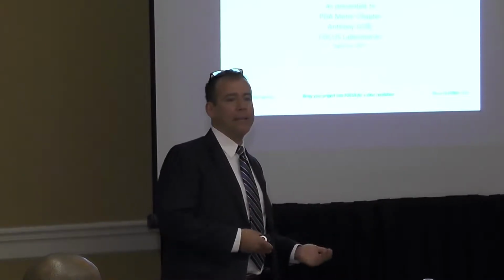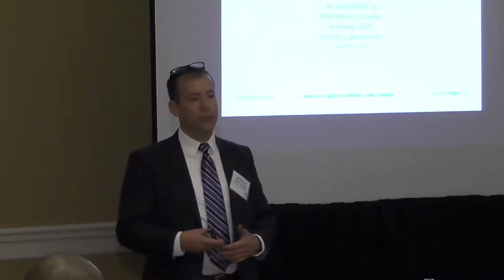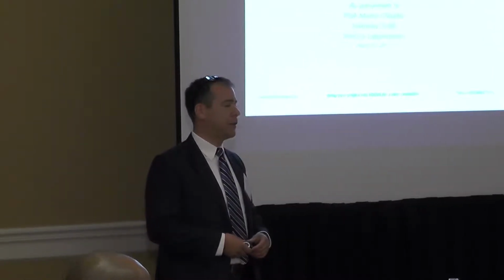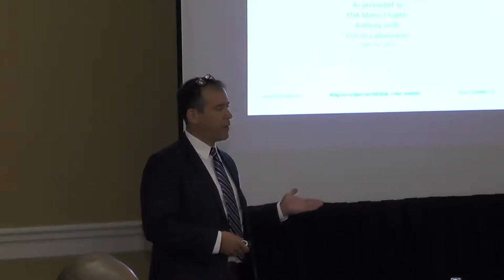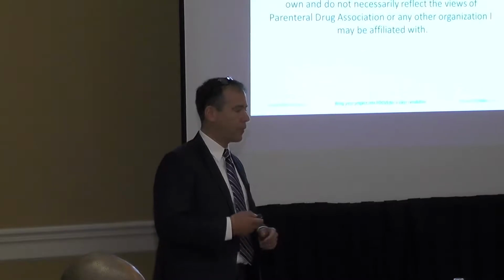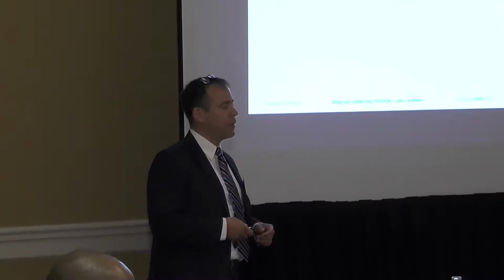So my intent here is to give some reasons why you would want to outsource, some things you should look for, and some risks in contract testing. And then, as Laura said, some of the things under the hood that you might not think to look for. All right, so these are just my opinions, not PDA's opinions.